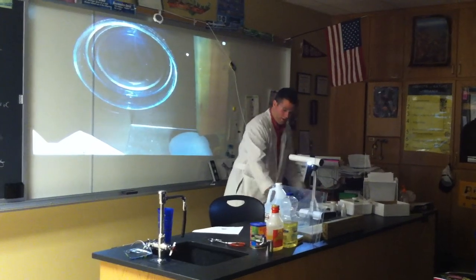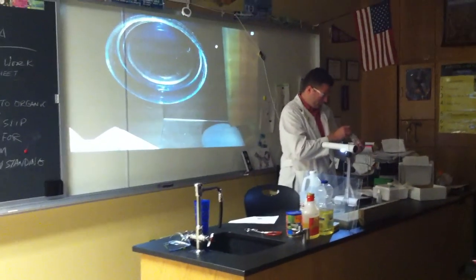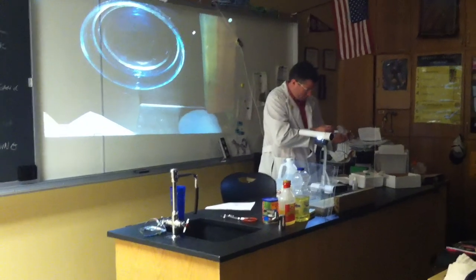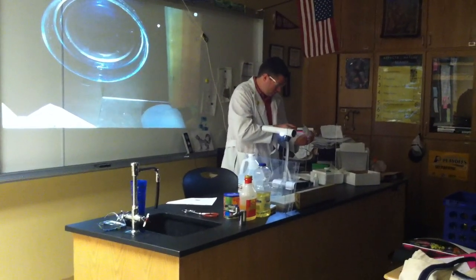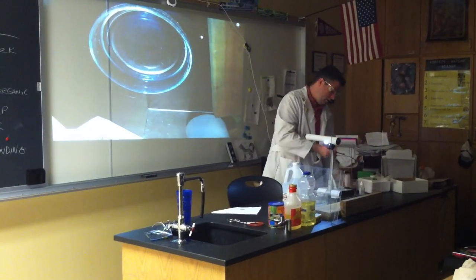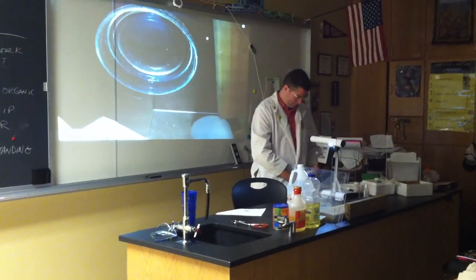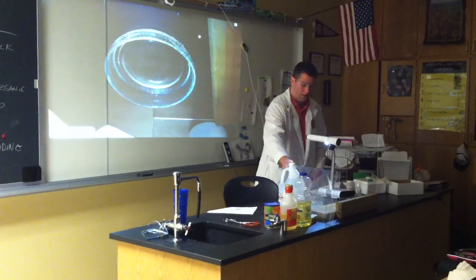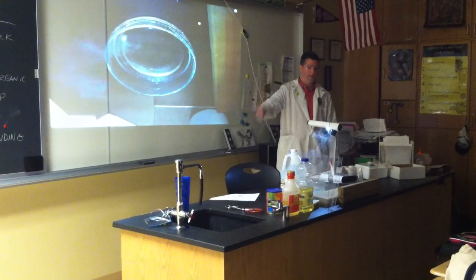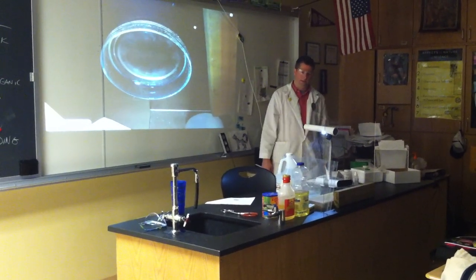All right. That's kind of lame. I want a bigger one. Yeah, let's make a big chunk. All right, just for you guys. Let's make you regret it. See, I don't want one too big. All right, we'll do a bigger one. Can you do it in the swimming pool? Wipe off the oil so you get more of a reaction. All right, here we go. Ready? Boom. Whoa. You can hear it sizzling. That's heat. It's actually vaporizing some of the water. Sometimes it catches on fire, sometimes it doesn't.